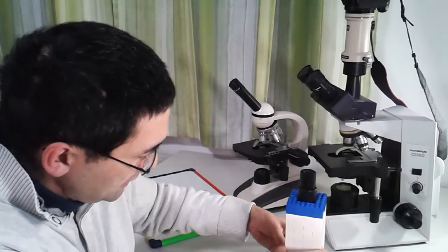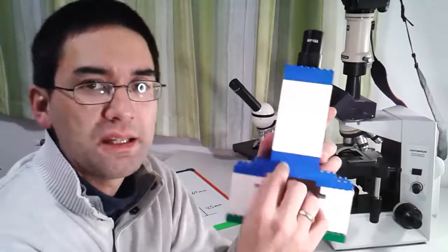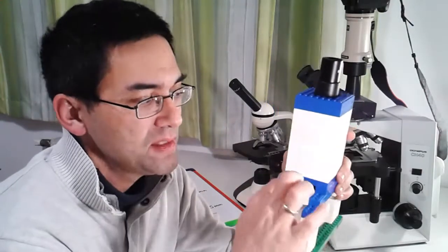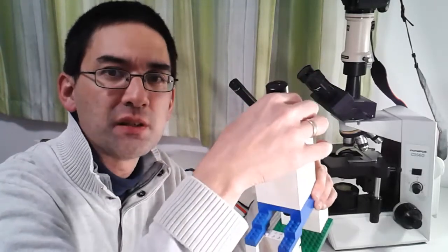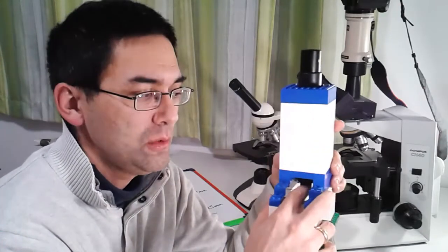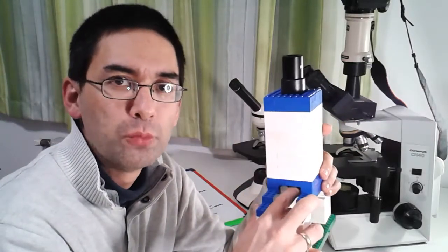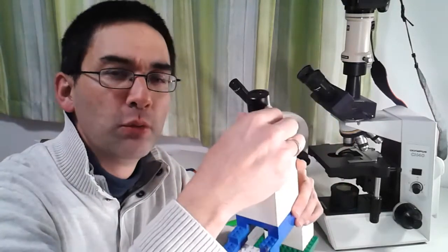The delicate part is that if the distance between the objective and the specimen is not right, then no amount of refocusing over here is going to give you a sharp image. That is really important. This distance down here is more important than the distance up here, because if you move it only a little bit down here, you change the focus a lot. So if you don't see anything, keep the eyepiece position constant and just try moving the objective down here a little bit until you get a clear picture.